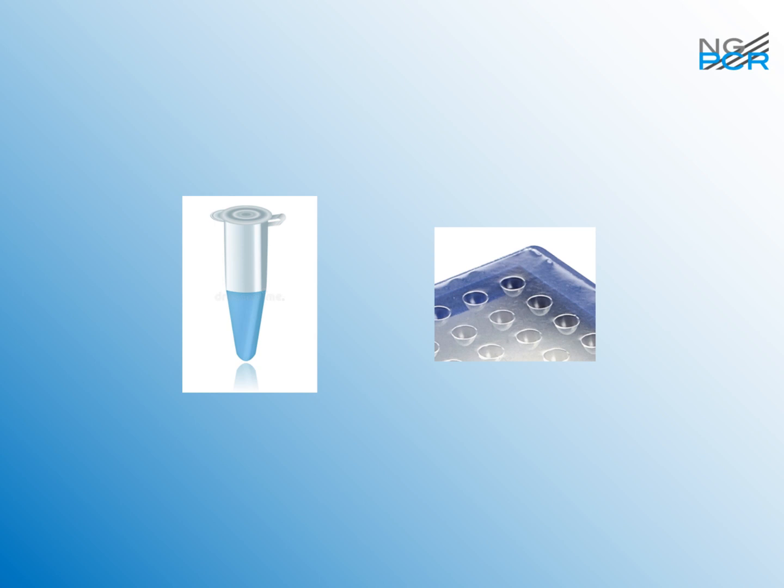Because not only is polypropylene a good isolator, still standing liquid, as still standing air, is also a good isolator. You can think of a thermos bottle which you use to keep your drink cold or hot. That's a double-walled bottle, and between the walls is air. If the air is not moving, it's a very good isolator. If there would be liquid, it wouldn't be as good an isolator, but if it's not moving, it would still be a pretty good isolator.